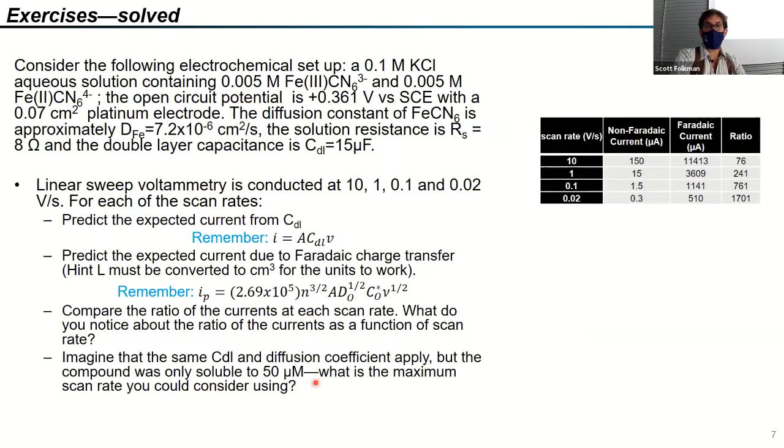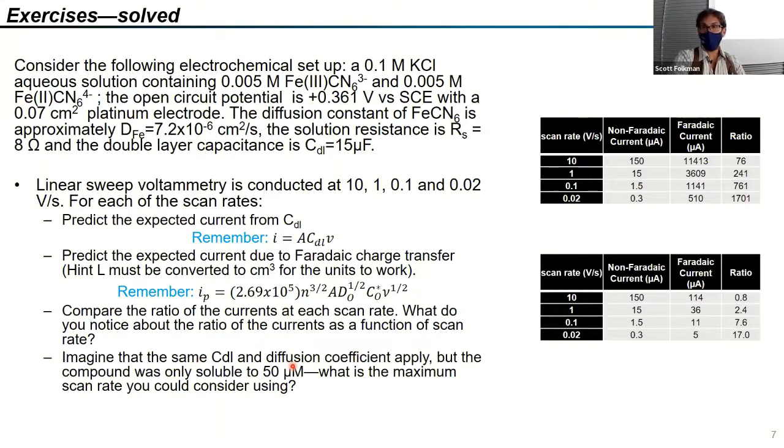Now, I wanted to imagine a case where the analyte is sparingly soluble, which can be quite common for organic reactants. And if we consider that many organic solutions will have a very large solution resistance, this can become very problematic because we can see that at fast scan rates, the amount of Faradaic current can actually be lower than the non-Faradaic current. So this can become problematic when we're doing analysis in non-aqueous solutions.